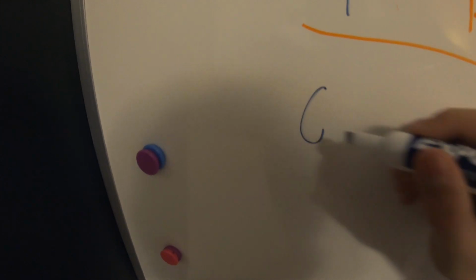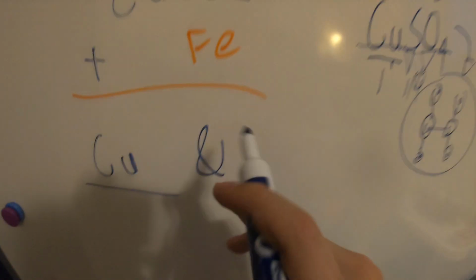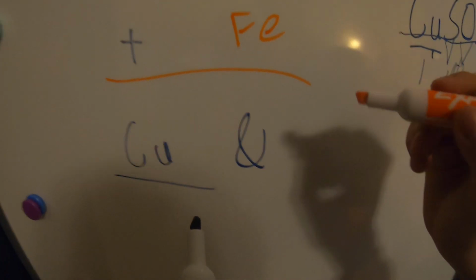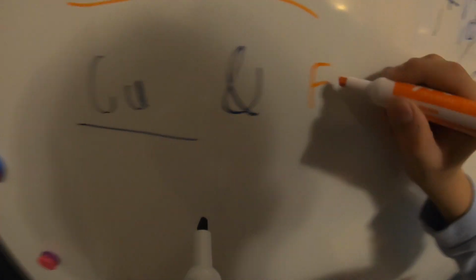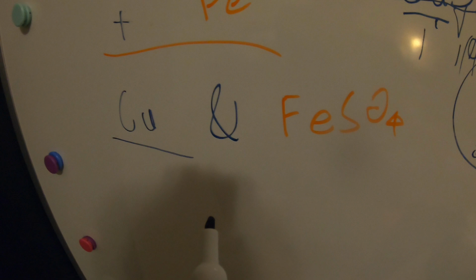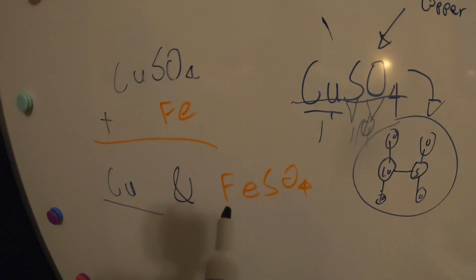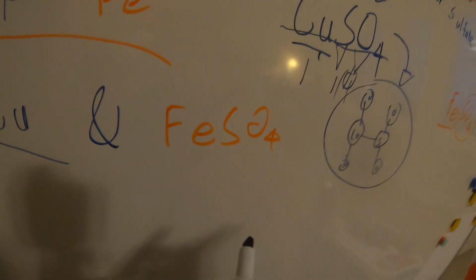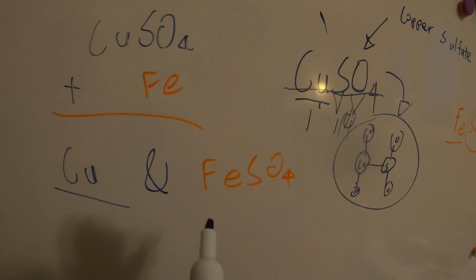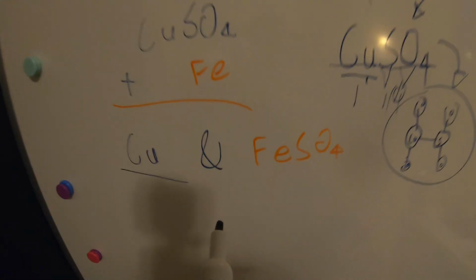We'll get pure copper and we'll have iron sulfate, which is just what we talked about. So, let me show you why this happens. It's because the copper is much less reactive than iron in this case.